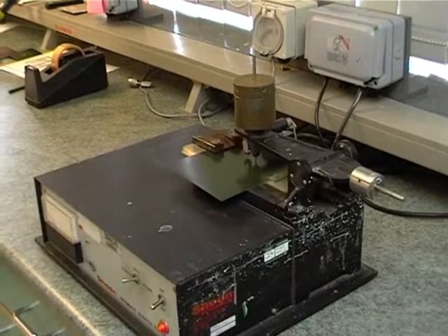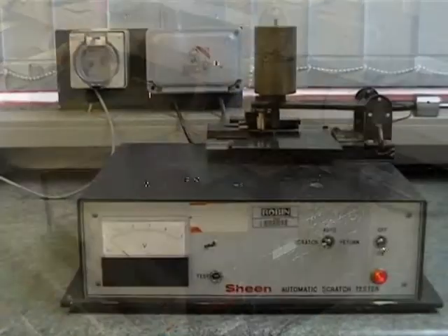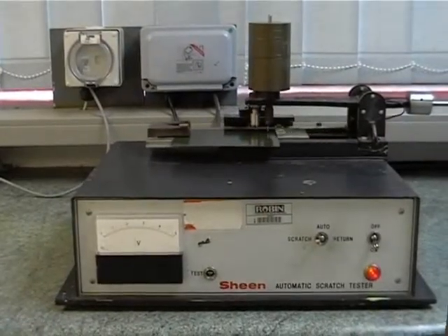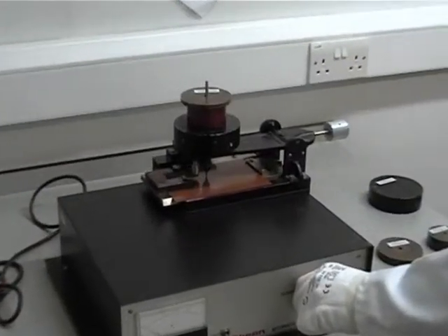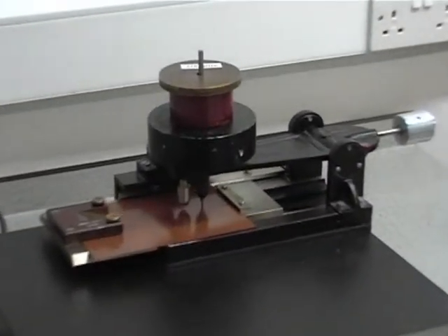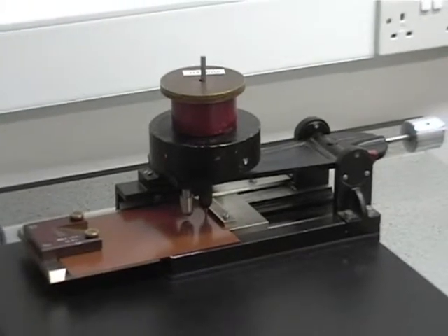EN13523 Part 12 is used to assess the resistance to scratching of pre-painted metal. A special piece of equipment is used to ensure that a needle is dragged across the test specimen with a uniform applied force.